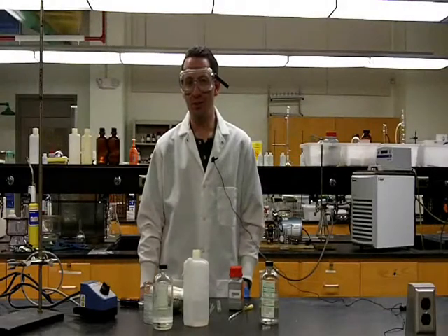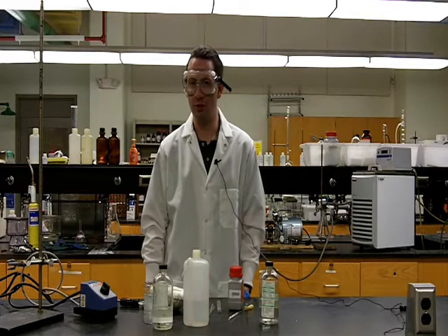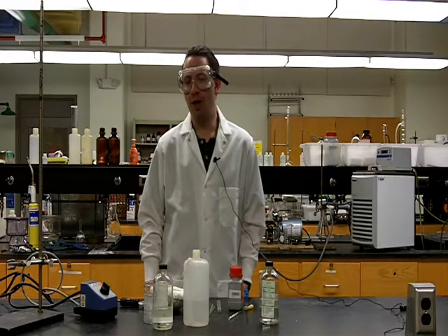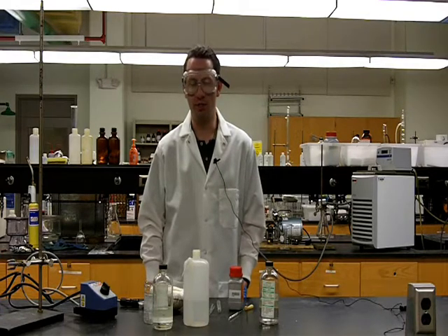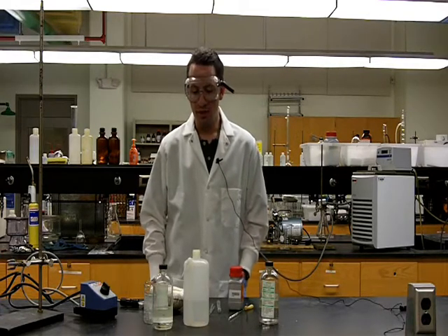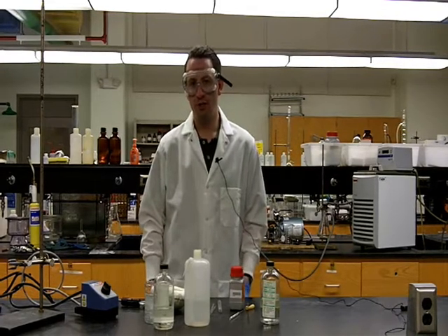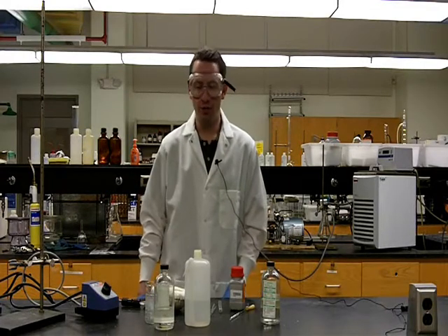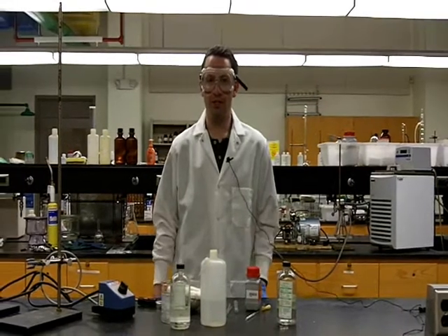In this video, we are going to learn how to properly choose a solvent for recrystallization. In order to choose an appropriate solvent, that solvent must satisfy several parameters. First, the compound being recrystallized should have high solubility when the solvent is hot and boiling, and should have very low solubility when the solvent is cold or at room temperature.